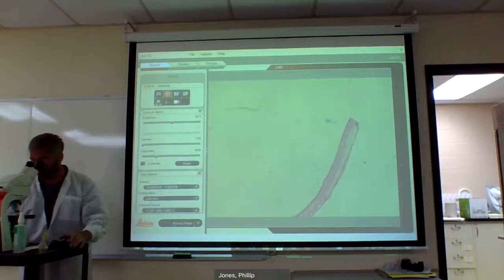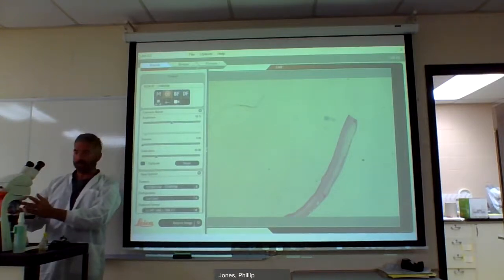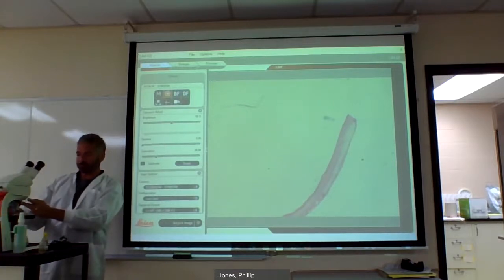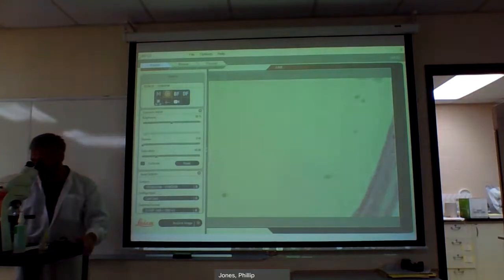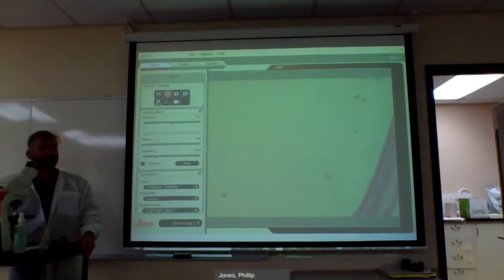The ciliated brush border is the outside of your body — it's going to be the apical surface. I'm going to take my objective lens, rotate the nosepiece clockwise — don't grab the lenses themselves. You're going to click it in. Now, can you all agree — I didn't do anything with my microscope, but what happened to my image? It moved, it got closer, it got bigger.